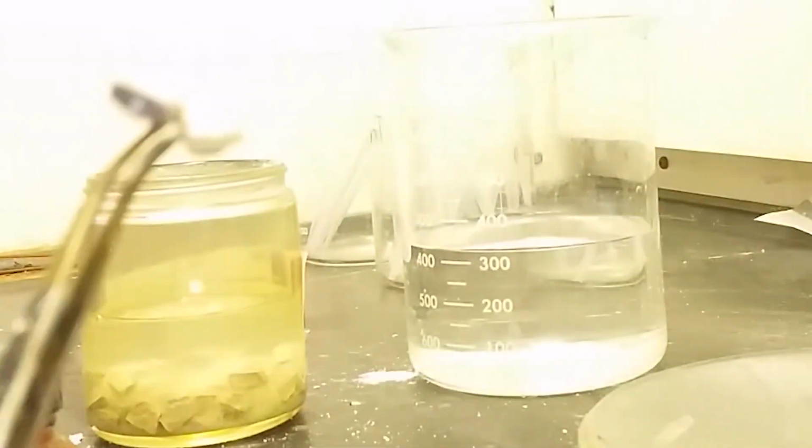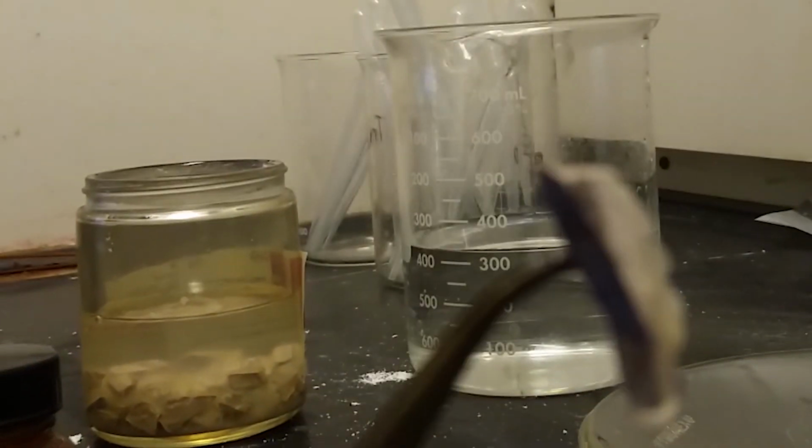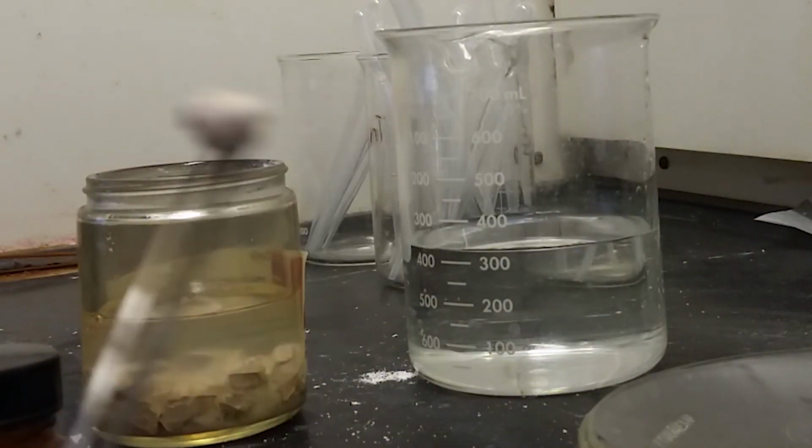Sodium metal is reactive with water. So, here's a piece here. I'm just going to turn the light on briefly so you can see it. Here's the sodium metal itself, kind of not very lustrous. And then it reacts with water, so we're going to put it into water. We're going to observe what we see.